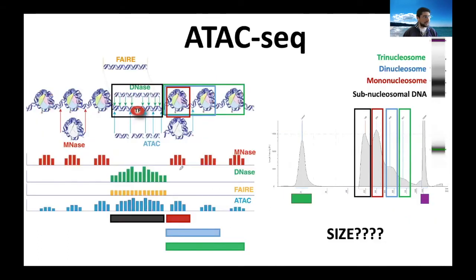So what does an ATAC library look like? It's very different from our regular libraries. We'll see a view of the TapeStation, but for now, basically disregard these purple and green peaks, which are actually green and purple here. I'll explain that to you tomorrow. But basically, you don't see a smear like we are used to seeing in our final libraries. You actually see a ladder, okay? And the ladder is reflecting the chromatin that we are capturing, okay?